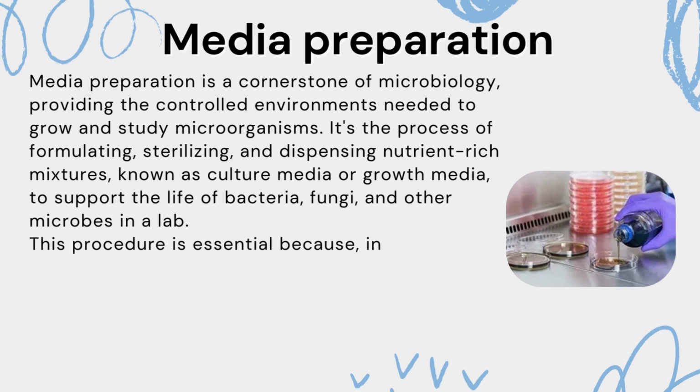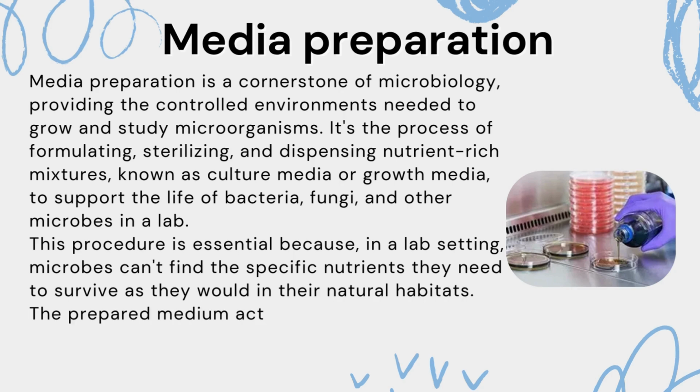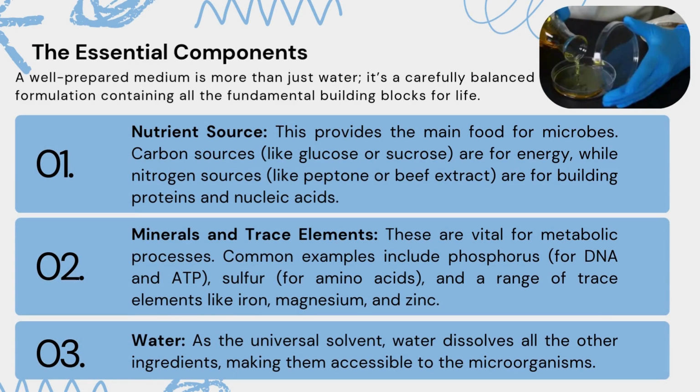This procedure is essential because in a lab setting, microbes can't find the specific nutrients they need to survive as they would in their natural habitats. The prepared medium acts as a substitute, providing all the necessary components for growth. The essential components of culture media: a well-prepared medium is more than just water. It's a carefully balanced formulation containing all the fundamental building blocks for life.